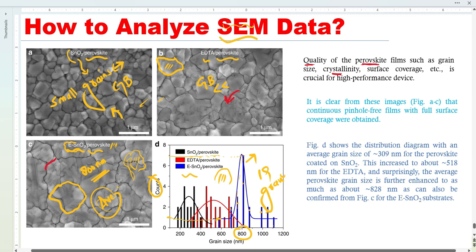The crystallinity is also related with the grain size. If we have large grain sizes, this means the material is more crystalline. So the crystallinity and grain size are basically directly proportional. We need this surface coverage, crystallinity, and grain size. How will we know? From SEM. It is clear from these images, from figure A to C, that continuous pinhole-free film with full surface coverage were obtained. This means that all three samples are very good - all three samples produce pinhole-free films.